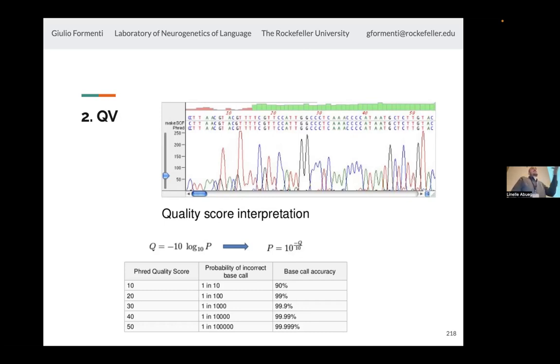Because if you see a sequence in the assembly that is never seen in the raw data, then there is a problem, right? We made up that sequence, which can sometimes happen because of all these steps of the assembly process. For instance, in the OLC graph, you have to find the overlaps, create the graph, and then generate a final consensus. So if any of the algorithms throughout the process fail to generate the correct consensus, then you introduce k-mers that never existed before in the reads, but they're now seen in the assembly.